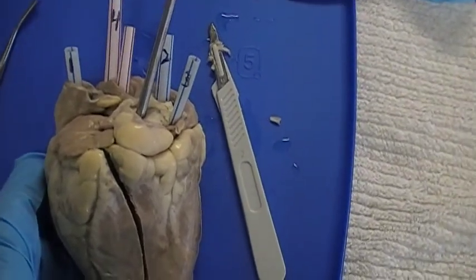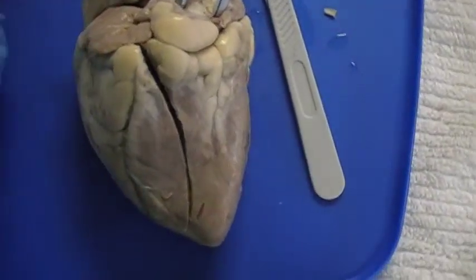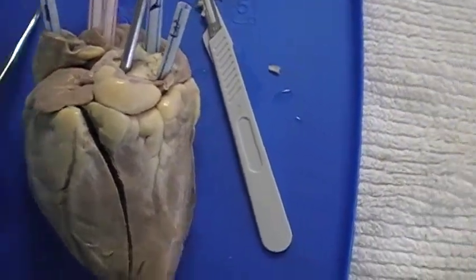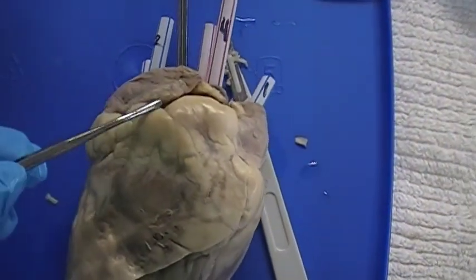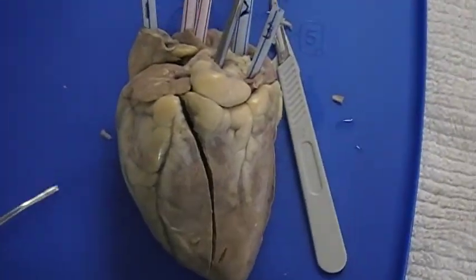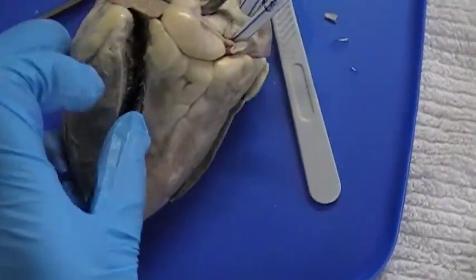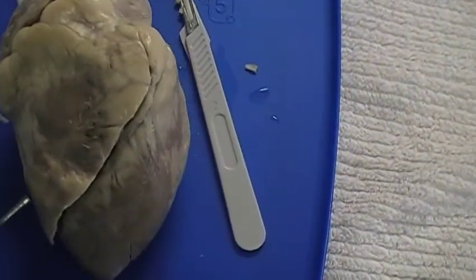The right and left auricles are used for an increase in atrial volume, but you can see right here, this is the left auricle, and if I flip this over, the right auricle is kind of this guy right here. The right and left ventricles: the left ventricle is right in this area. If I can open this up one-handed, you might be able to see it in there. And the right ventricle is right here in this area.